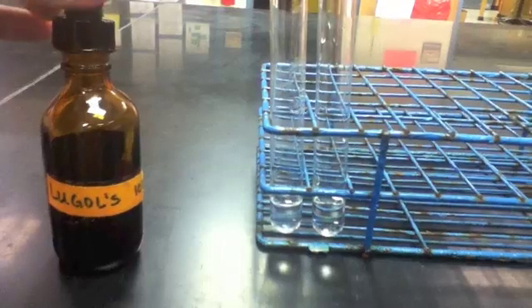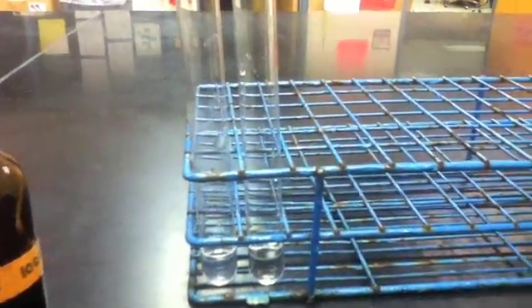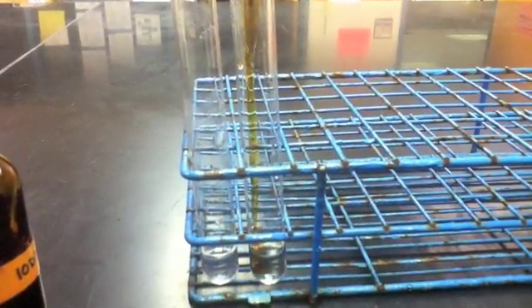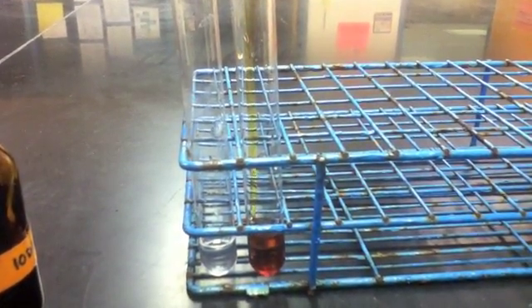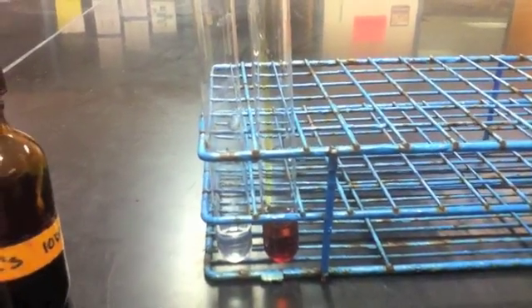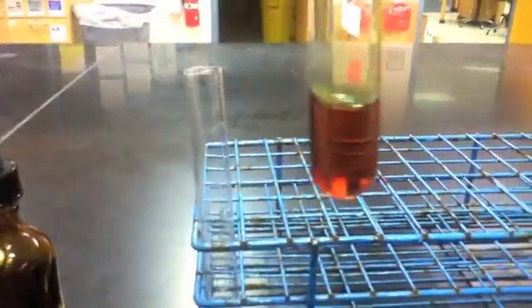I'll start by adding the iodine to the negative control tube. Without starch present, the mixture retains the original brownish-reddish coloration of the iodine. Even agitation does not change the color.